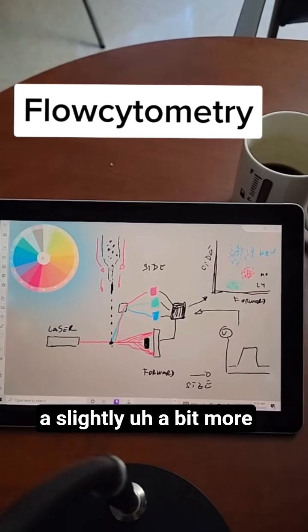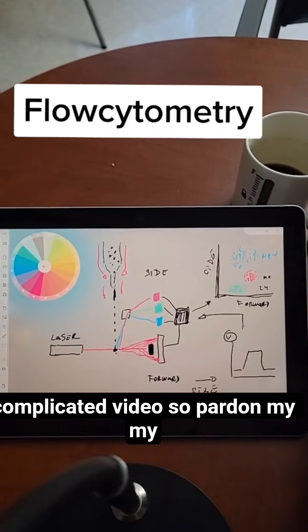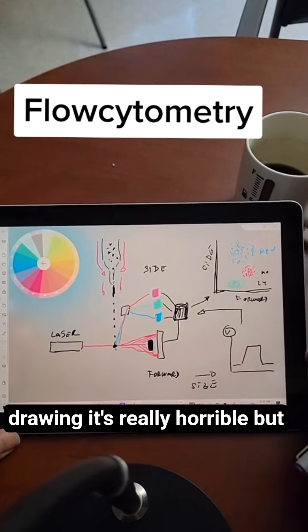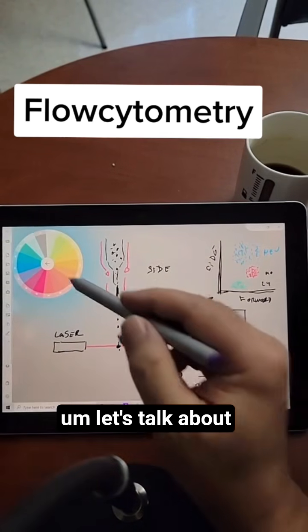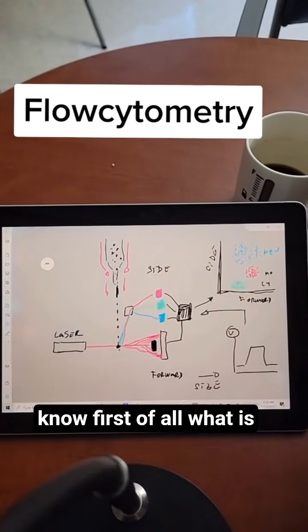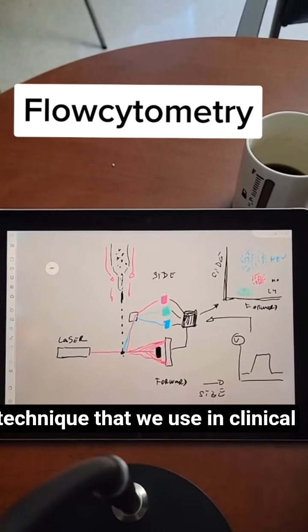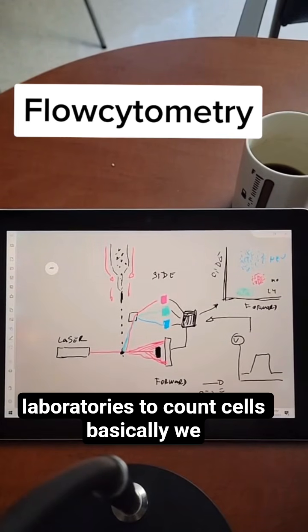So this is going to be a slightly more complicated video, so pardon my drawing, it's really horrible, but let's talk first about flow cytometry. First of all, what is flow cytometry, right? It's a technique that we use in clinical laboratories to count cells.